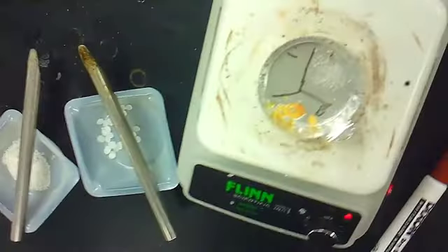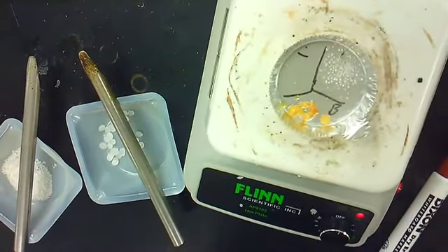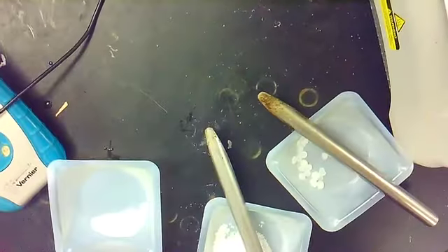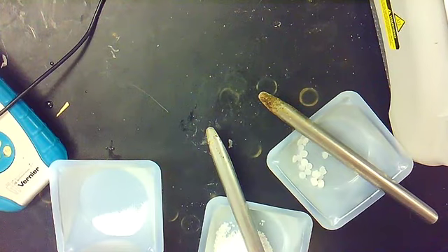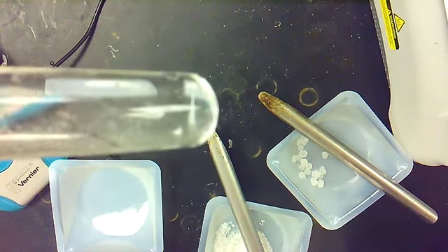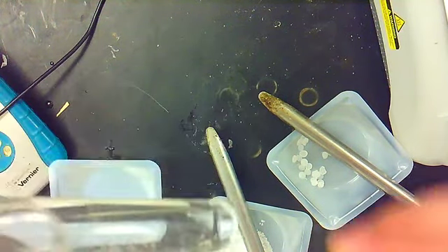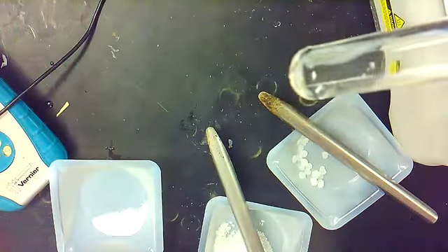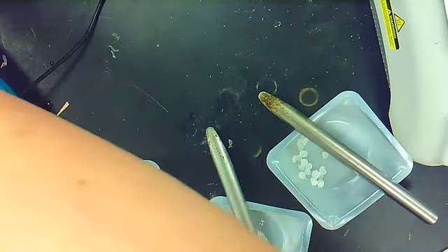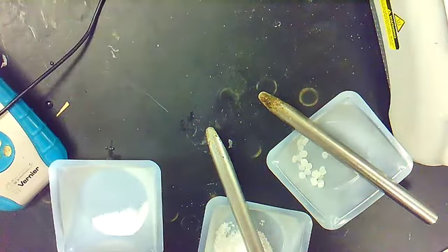Okay, notice how B is now bubbling and burning. Okay, all right. Looking at the tube. Right, it looks dissolved.